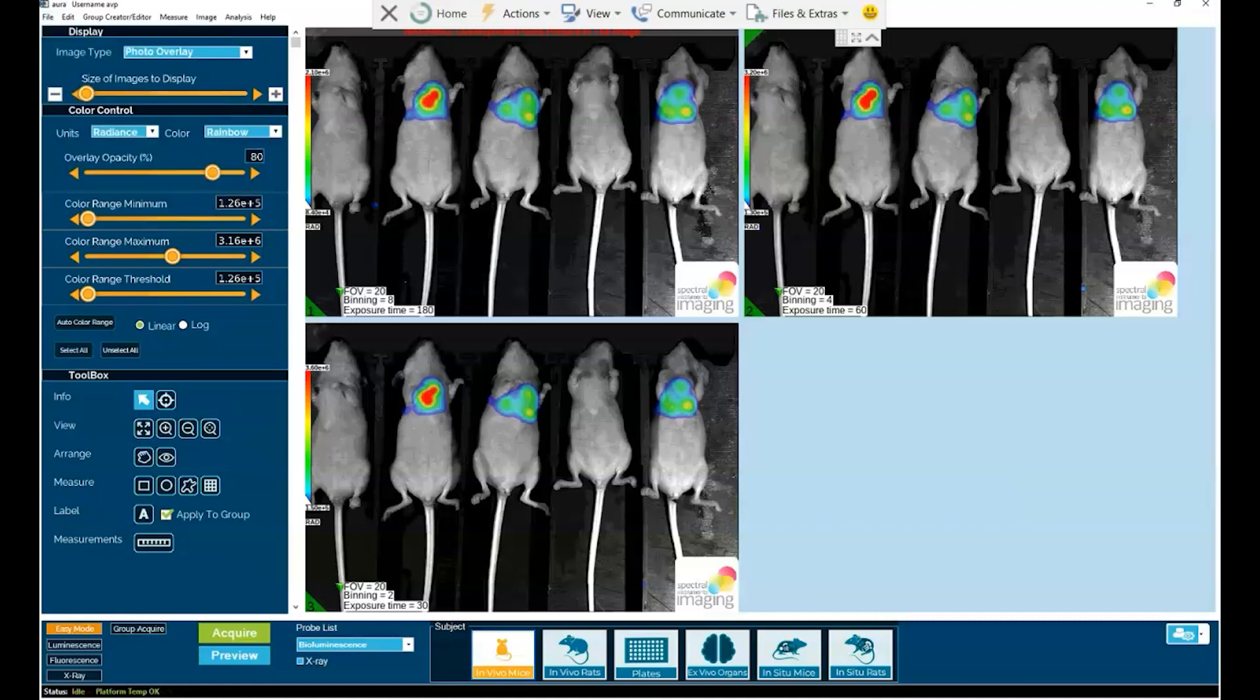So in summary, ORA 4.0 optimizes the optical imaging experience for the preclinical investigator by providing three new major features. Easy mode, which makes the process of image acquisition both faster and easier than ever before.